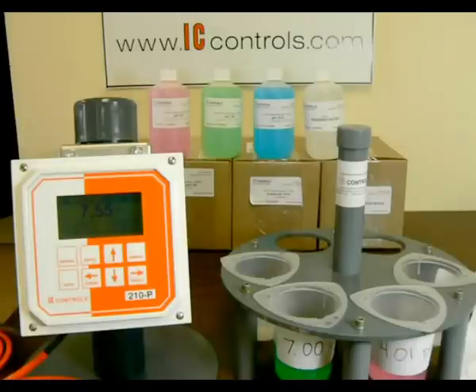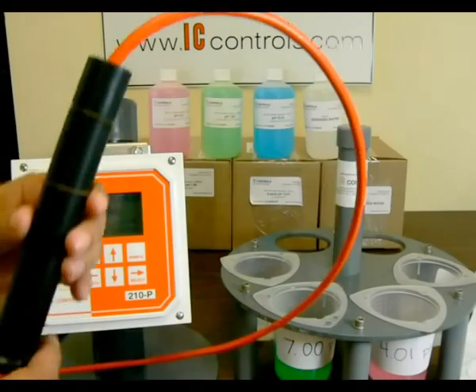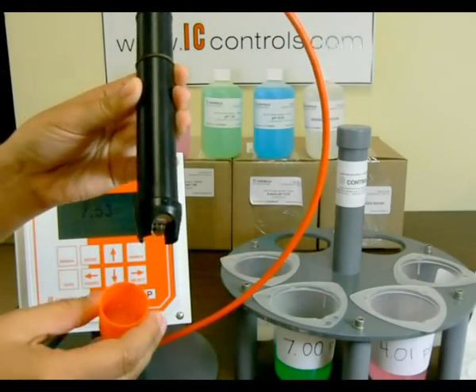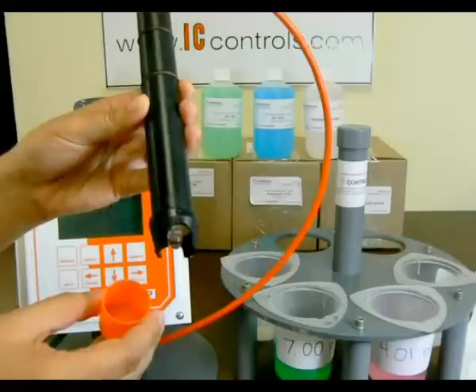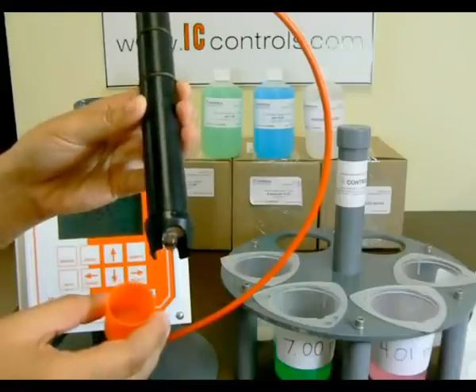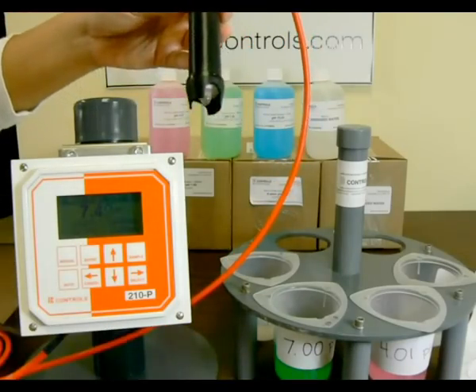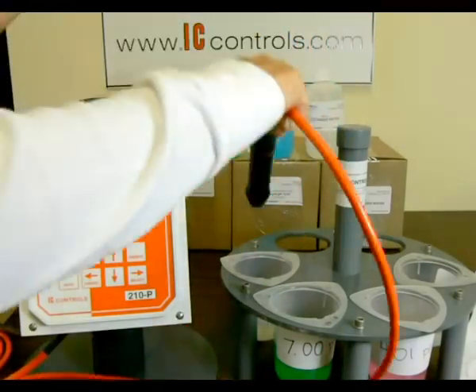IC Controls sensors come protected with an orange cap that contains pH storage solution to keep the sensor moisturized. Ensure you have set up your temperature to match the ambient temperature, otherwise your readings will be off. Remove the protective cap and rinse the sensor in deionized water.